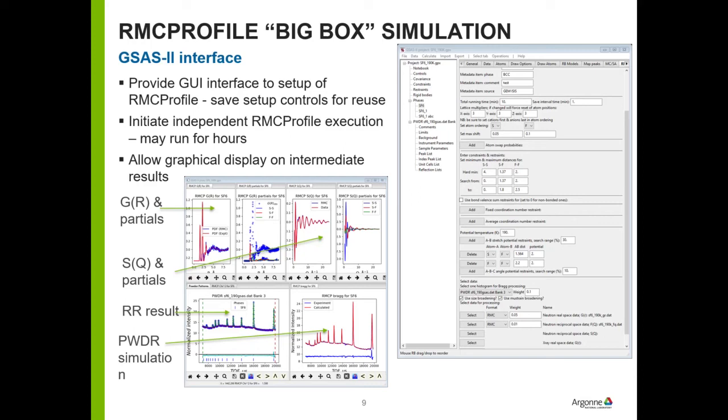And you can then save those setup controls and be able to reuse them and rerun the thing, or even run it and sort of update it and so forth. The thing about RMC Profile is it could run for hours on a big problem. You could easily have it run for 5 or 6 hours in order to get a result.